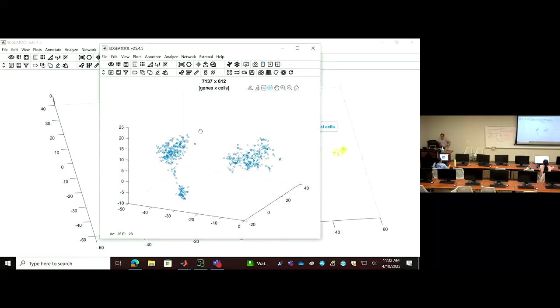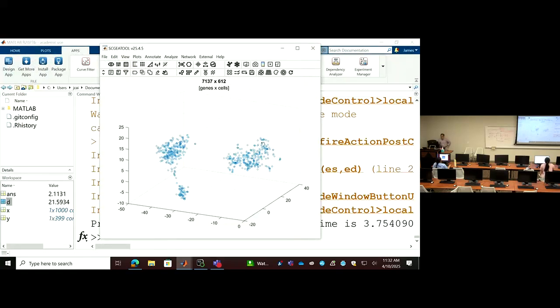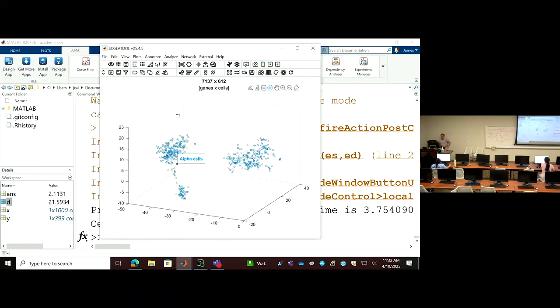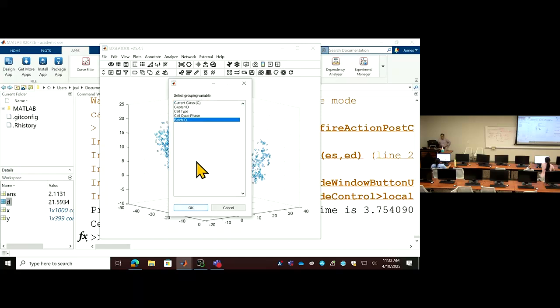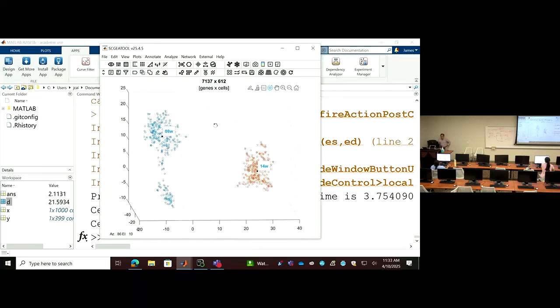This is the set of cells we will build a pseudotime for. So I can close this. In here, if you look at the annotation, there's only one cell type, but this cell type is from 2 batches. If you highlight the cells with batch ID, you will see this and that.